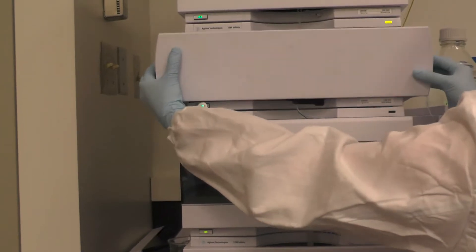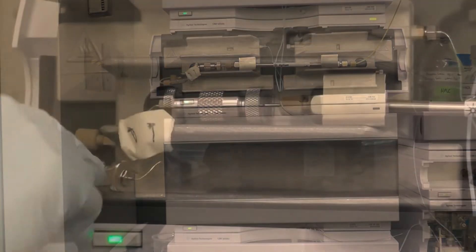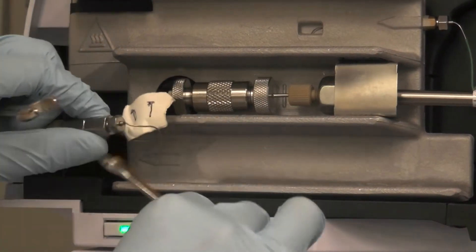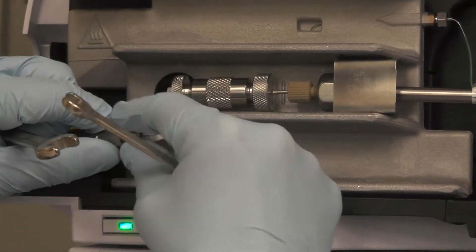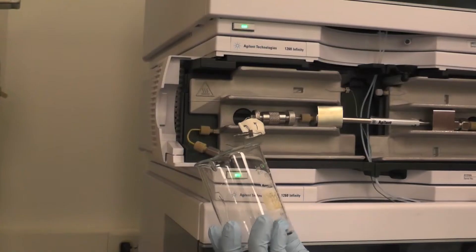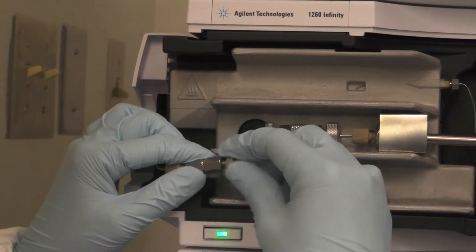Open the column compartment to ensure that an appropriate column has been installed. Detach the left column holder and allow the system to purge for a couple minutes in order to get rid of any bubbles and or leftover liquid from previous uses. Collect the liquid into a waste container. Reconnect the column holder.